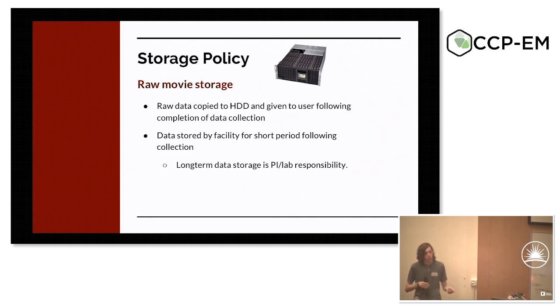So we will store a copy of our users' data locally for a short period of time, say a few weeks to a month. And then, once we've checked with the user that they have their data and they've signed their life away saying we realize our data will be deleted, we just wipe their data automatically. The onus for data storage is entirely on the member labs. One of the reasons we did this is because we are a multi-user facility. The labs that collect our data do not process against our file systems. And frankly, we just didn't have the resource or the will to become data curators and keep on top of every micrograph that's been collected.